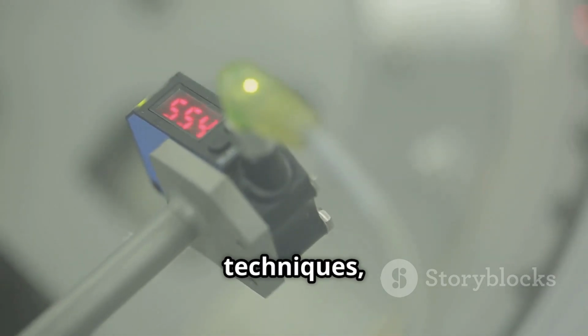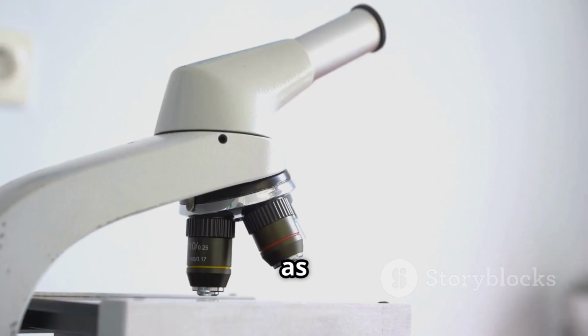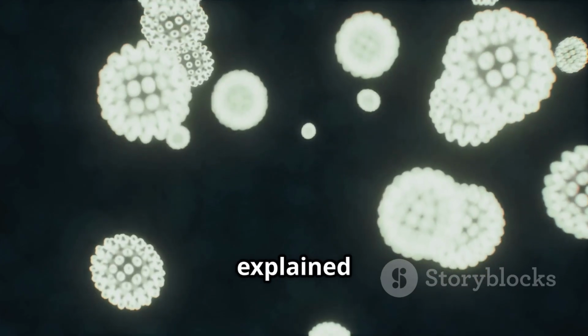In thermal analysis techniques, heat is used as source. Working principle of techniques are different as per requirement. Some techniques are explained here in detail.